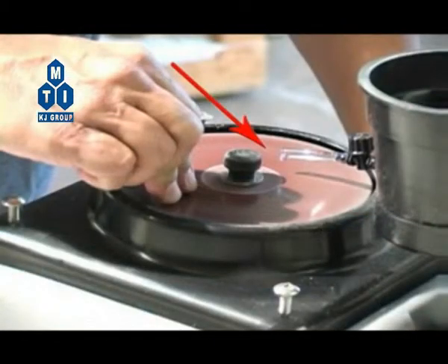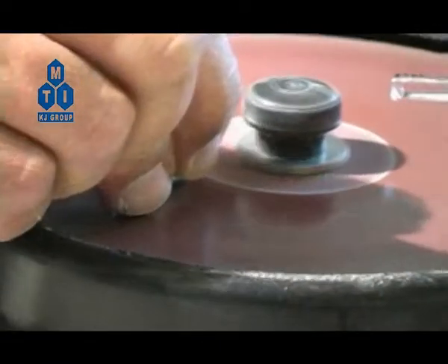Note: if the plastic tube is not the right length, use a pair of scissors to trim it so that the tip of it drips water onto the center-most area of the disc.